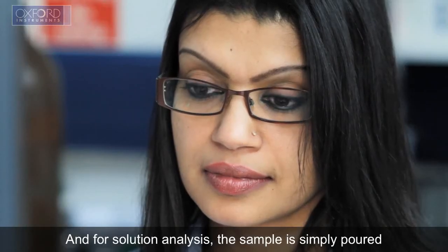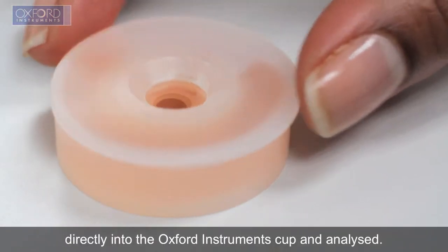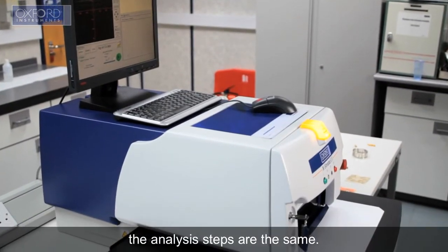For solution analysis, the sample is simply poured directly into the Oxford Instruments cup and analyzed. When measuring samples for elemental composition, the analysis steps are the same.